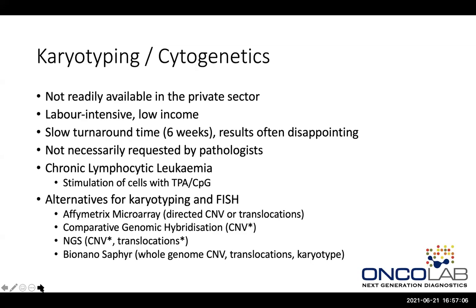Now, just in layman's terms, both the microarray and the comparative genomic hybridization are like a method where one measures a patient sample, be that DNA, RNA, or whatever, against an equal amount of a control sample, or a normal. The patient sample is labeled in red, the other sample is labeled in green, and for each little spot, if you get more green or more red, you know you've got more or less compared to the control that you put in.